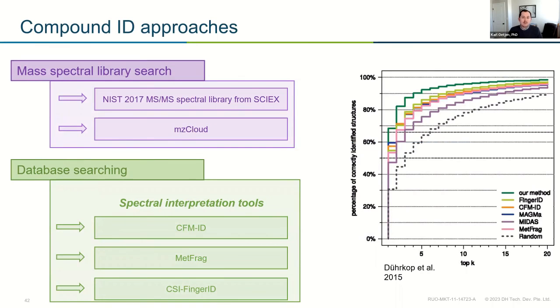And finally, I'm going to be going in pretty deep next session into the non-target portion. And a lot of this will get explained in much more detail. But when it comes to non-target, when it comes to suspect list screening and you don't have a library, let's say there's just not one available, I can make a list from a lot of different compounds, right? I could grab a list from PubChem. Maybe these are theoretical things that should exist.